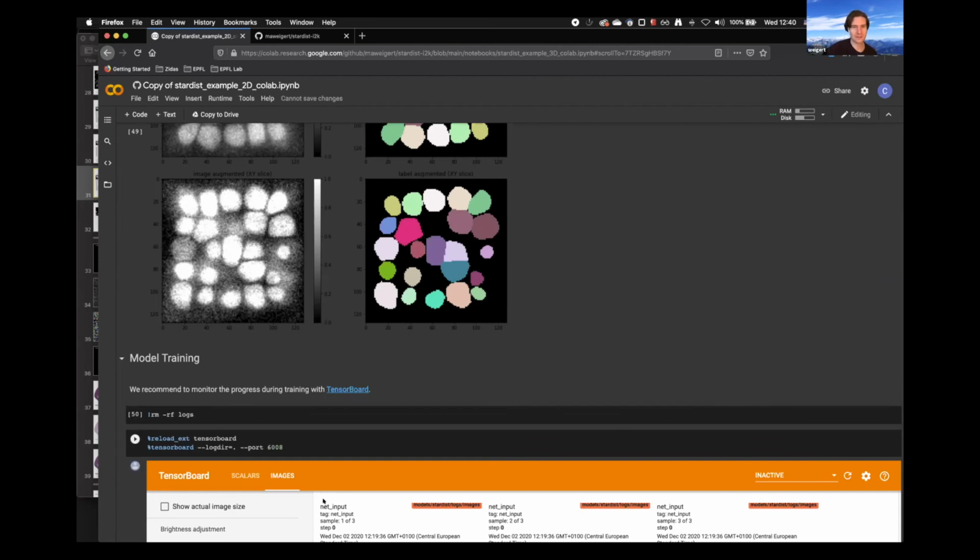So if we do cell segmentation, could you just segment the whole cell without doing the nuclei? Yeah, sure. But then the problem is always to find the correct instances if you have a lot of touching cells. You would have to annotate the nuclear region that is star-convex, predict that, and then do some expansion step based on a probability map that you could get out, or other means. So you would have to do an additional step. Yeah. Okay.